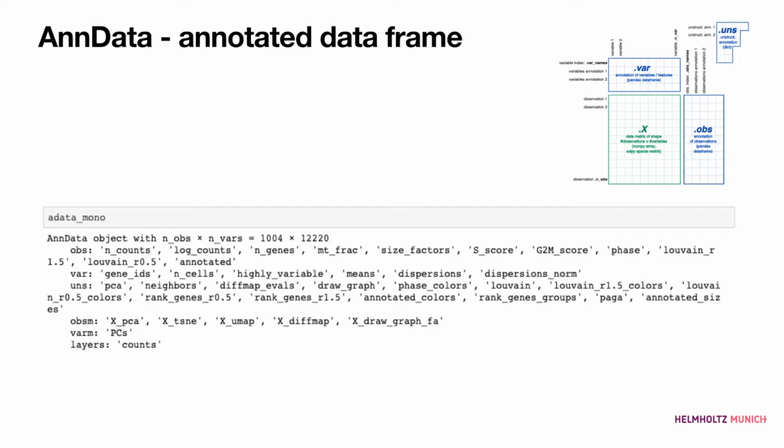In this AnnData, in X, you will have the already normalized gene expression data, and in the counts layer, you will have the raw counts that you got from your sequencing protocol. This is a way how you can store raw data, because these counts are used by some of the processing methods, like for example doublet detection. You actually need the raw counts and not the normalized data matrix. So it is useful to know where this is stored.